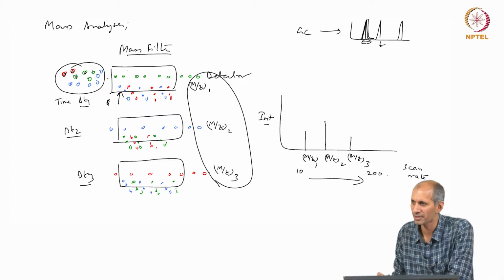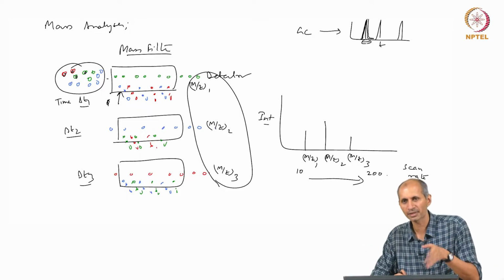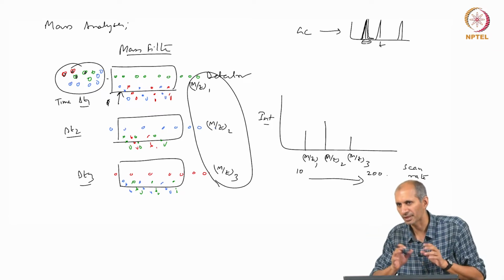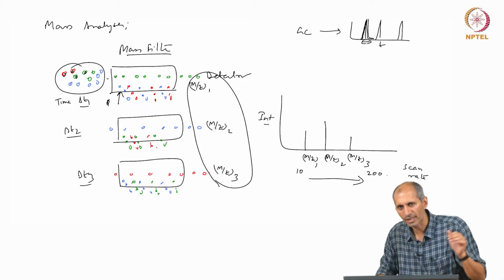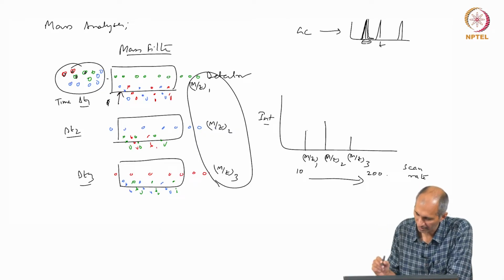What we mean by well mixed is that at 1 second and 1.2 seconds the composition is the same, that one of these fragments does not get ahead of the others, which means there will be a problem at that time. So, we assume that they are all well mixed, and then you pull out all of them except one and then measure that. This is the intensity, okay.